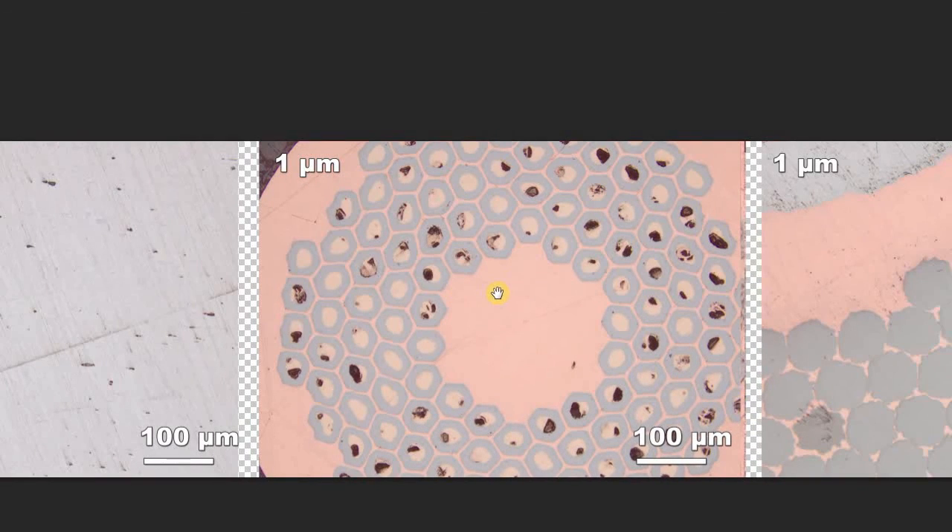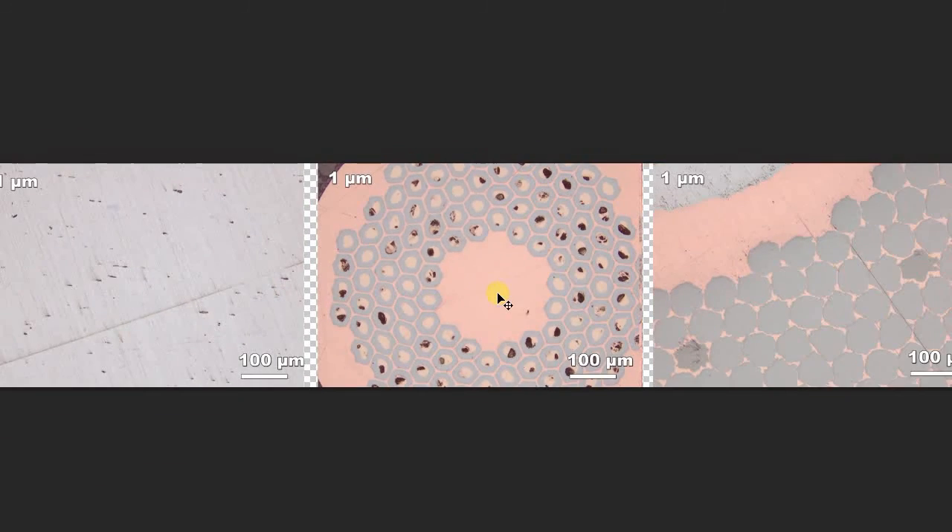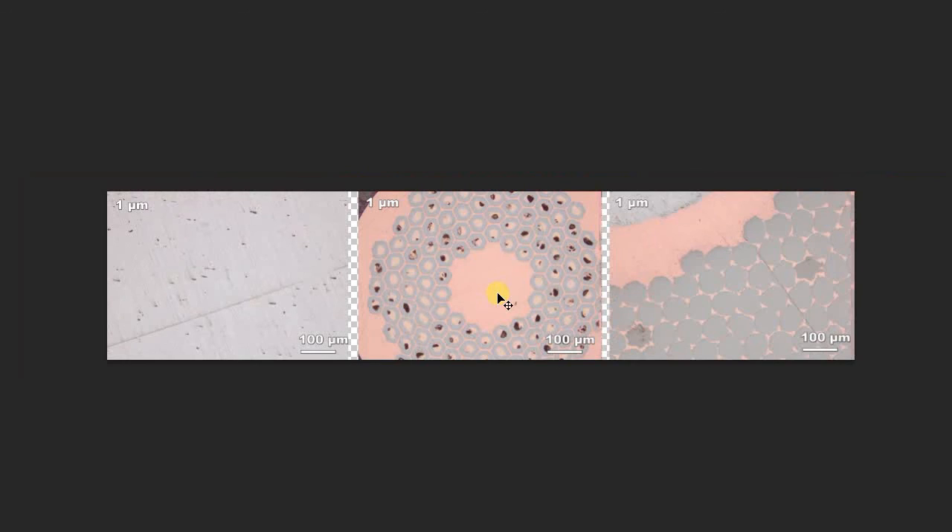So it's crucial that you take your time and do a proper polishing job. Now these are ready for the vibrational polisher. That's it for the diamond polishing of the transverse samples. If you want to see how I polish the longitudinal cross sections, you can click here. If you want to see the final polishing and cleaning of the transverse cross section, you can click here.